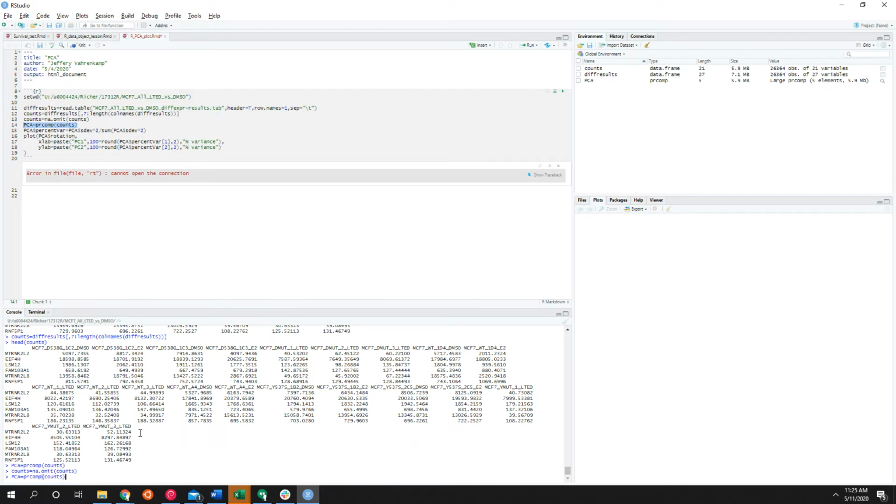If you imagine you plot each one of these genes in a scatter plot, the larger the spread, the larger the amount of variance you're getting from that gene. It actually does combinations of genes, I think, but that's what each of these principal components will be: the sets of genes that contribute to the largest spread between all these columns. So the gene that separates the different samples the most.